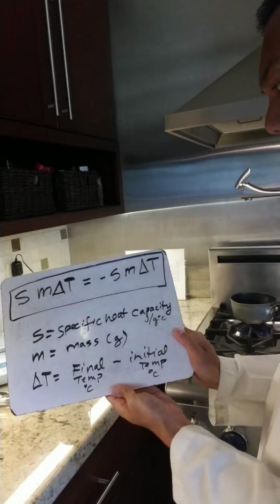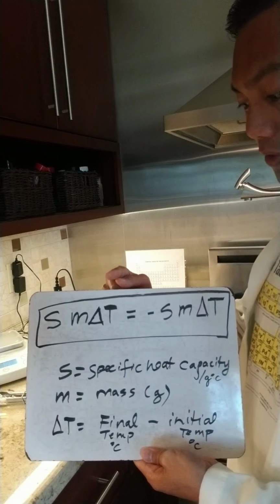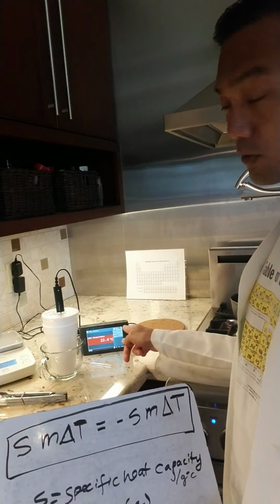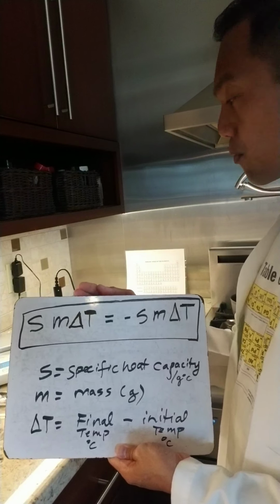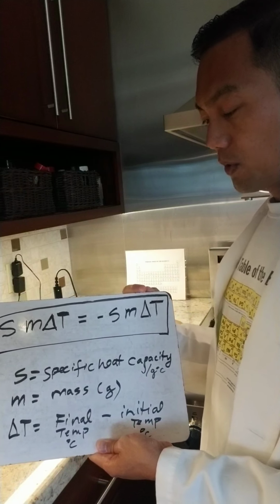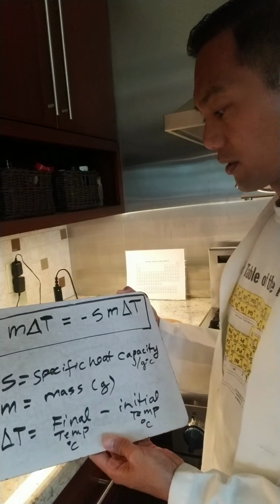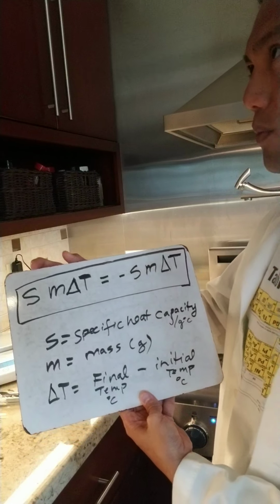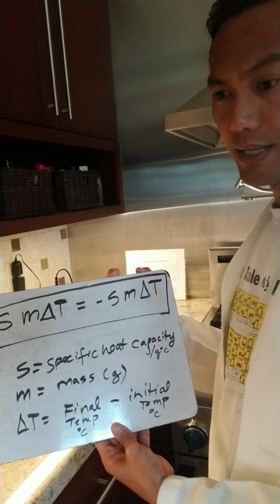All right, sorry, going back to this while we're waiting. The final temperature for both this side and this side will be whatever we call the final temperature in our reading. The initial was different, right? This side will have the initial temperature of the metal, which was 100 degrees. This side will have the initial temperature of our water. This side will have the water, the one absorbing the energy, and this side will be the metal, the one that's releasing that energy.